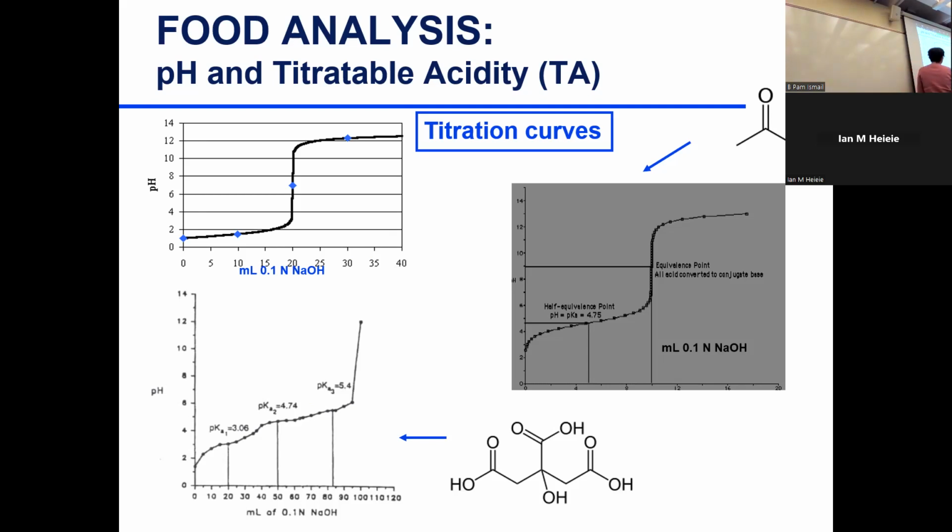And here's where it's very unique for organic acid. If we look at a titration curve for HCl, for example, the top one is for HCl. I don't know why I didn't label that. But this one at the top left, that is HCl. So here we see a gradual increase in pH until the acid is neutralized. We see a spike in pH, and if we extrapolate at this midpoint, then you get the milliliters of NaOH needed to reach neutralization, and you use that in the equation.